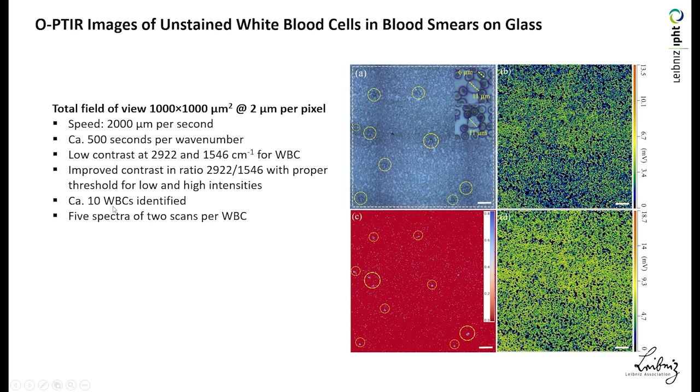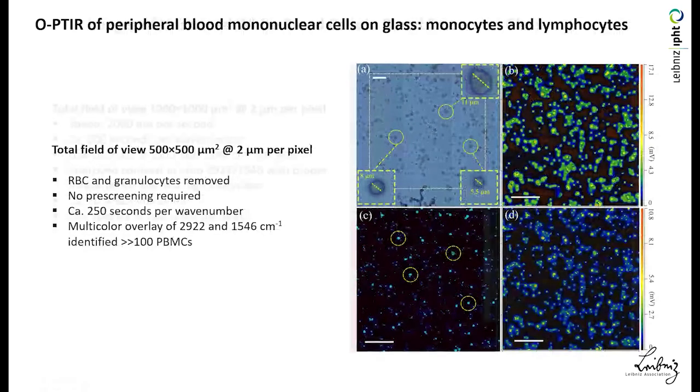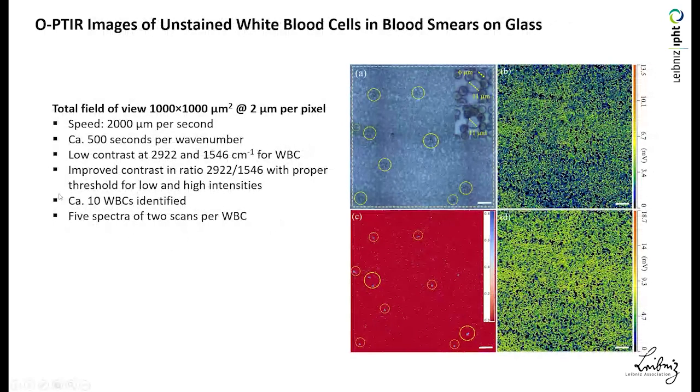Yeah, well, identification of 10 white blood cells in more than 20 minutes was not very impressive, and therefore we tried to improve the speed.